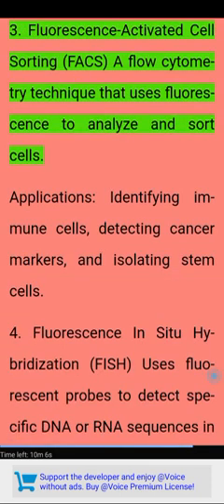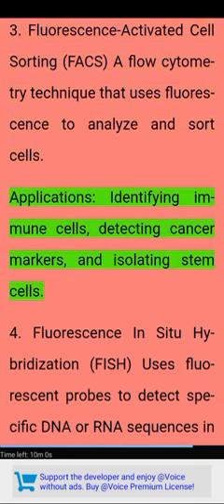3. Fluorescence-activated cell sorting (FACS), a flow cytometry technique that uses fluorescence to analyze and sort cells. Applications: identifying immune cells, detecting cancer markers, and isolating stem cells.